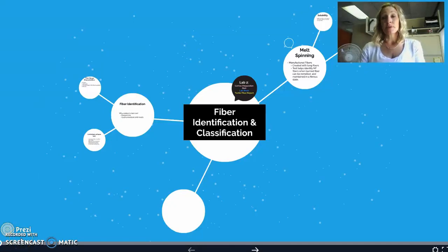So this week, our lab is going to cover fiber identification and classification. This video is going to go through just the basic information we want you to be aware of so you can make proper observations when it comes to your experiments and you can get the most out of it.